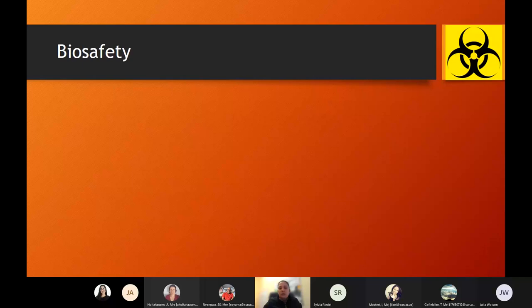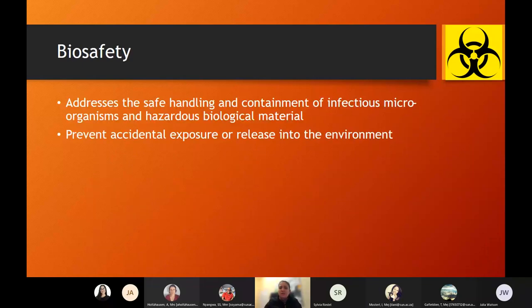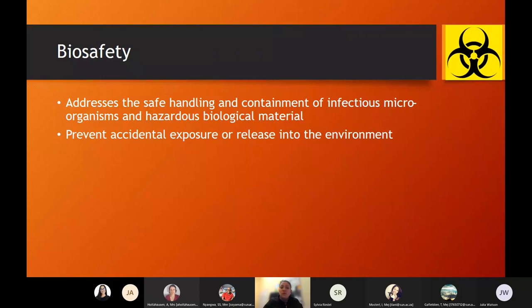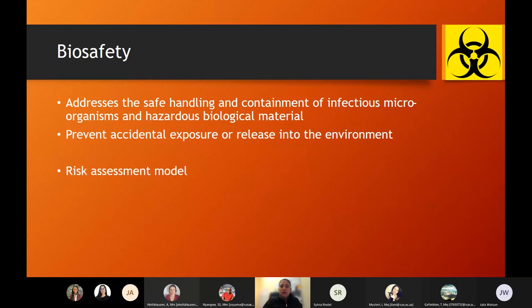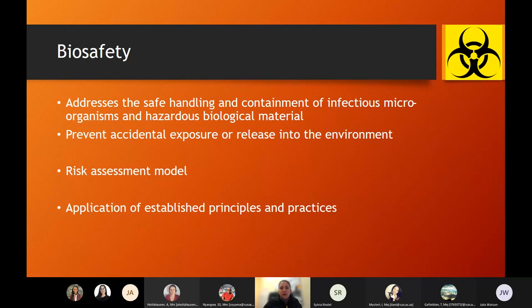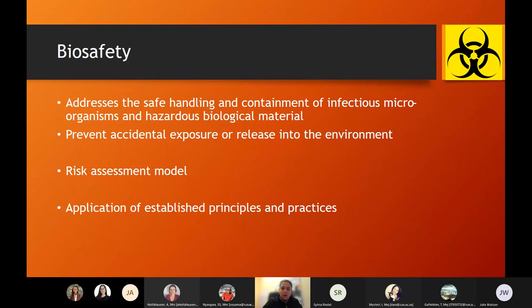Biosafety addresses the safe handling and containment of infectious microorganisms and hazardous biological material. It prevents accidental exposure and releasing agents to the environment — everything we put in place is to prevent this exposure and release. Biosafety is usually done within a model of risk assessment. You have to apply established principles and practices; there are already strict guidelines as to what should be done, what should be worn, and how you should discard waste in a biosafety level 2 laboratory.